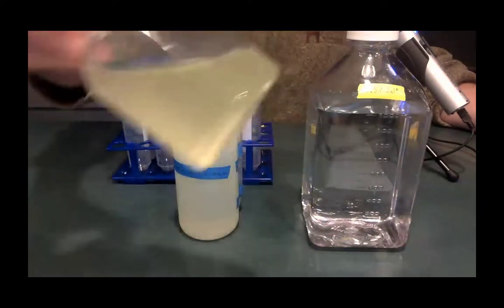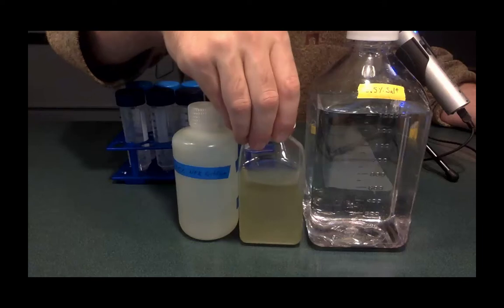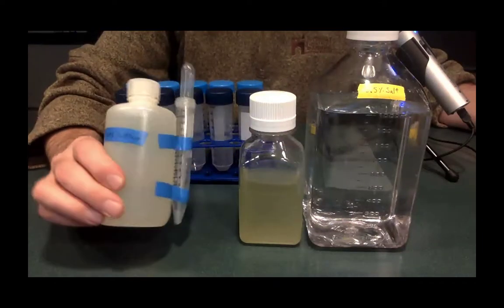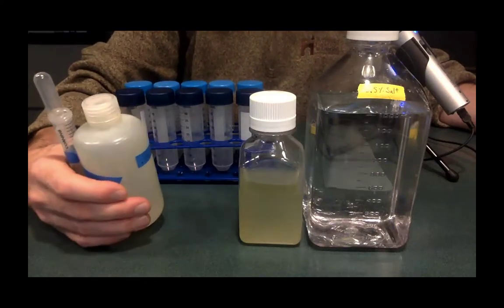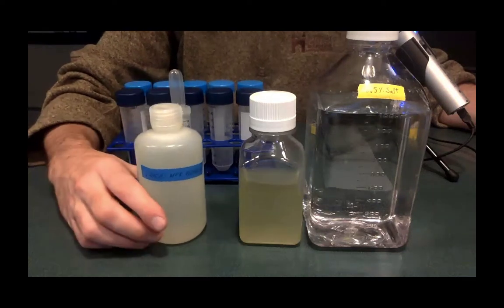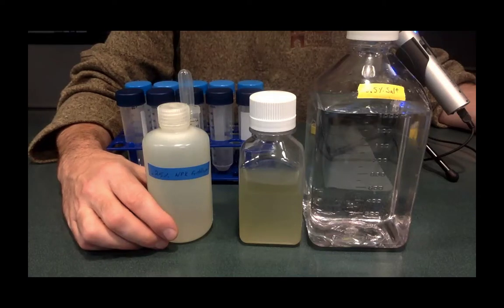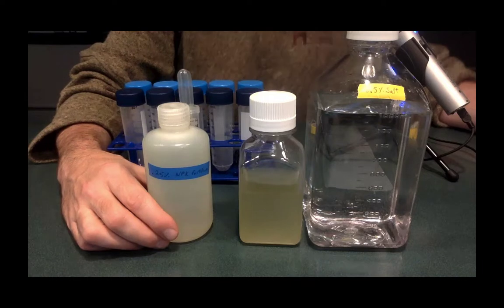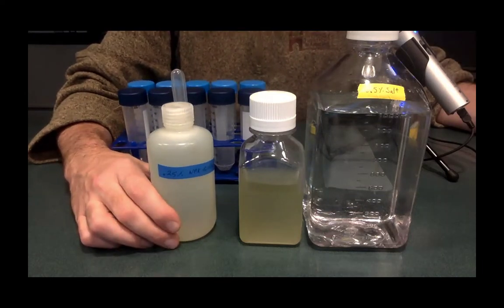I have a container of algae. I've got a large set of algae, so I've poured some of it into here from our larger stock. I shook it up and got a stock there. I have made a fertilizer from one of the many containers of fertilizer we have. This is an NPK fertilizer. It turns out that it ends up being roughly 2.5 grams per liter. So it's about a 0.25% solution that I made.